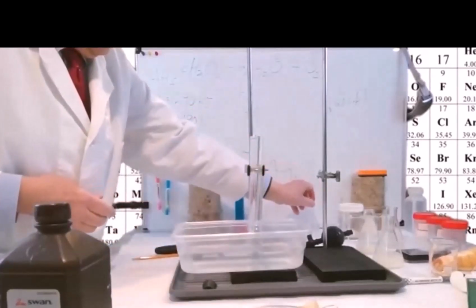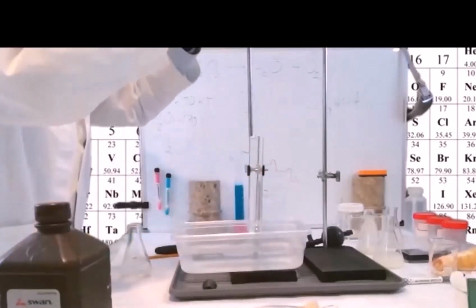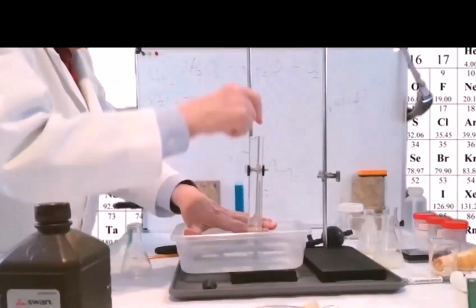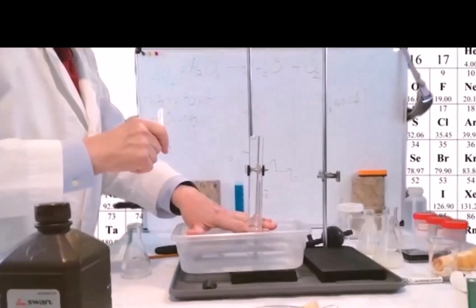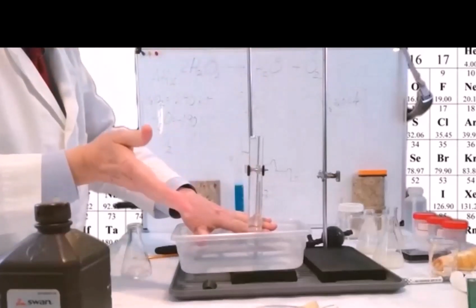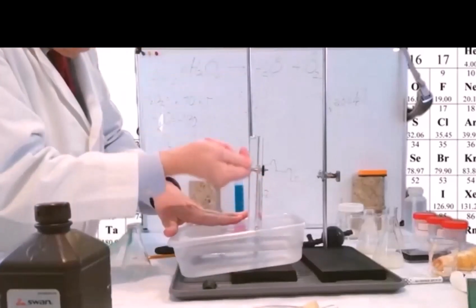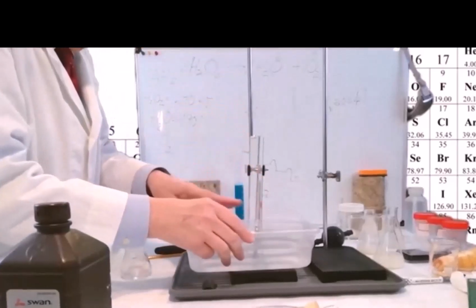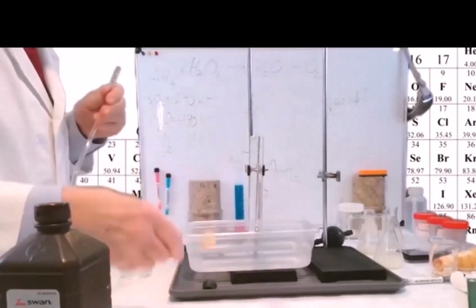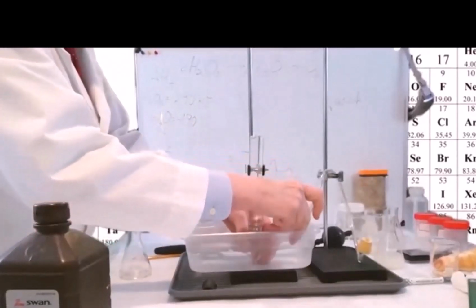There's pressure in the tub preventing it from going all the way out, right? Yes, atmospheric pressure is pressing down on this water. If I drilled a hole on top of this graduated cylinder, then that pressure could go here and this whole thing would flow out. Yes, our atmospheric pressure is pressing down, and our hydraulic pressure, excuse me, tip this water, it'd be a mess. Live theater, folks. Or if I were working in a vacuum, there wouldn't be any pressure, and that water would just come pouring out.